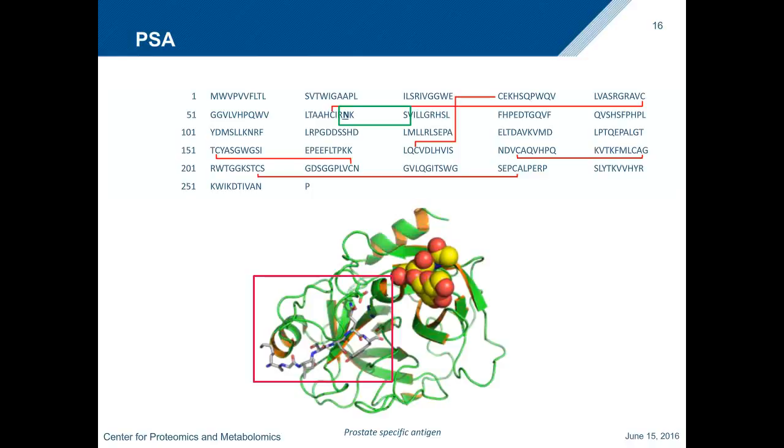So what we did, we reduced and alkylated our sample and performed a tryptic digest. If you do a tryptic digest, you will cleave off the arginine and lysine, and that means we will have a really small peptide backbone if we have a complete cleavage. So we only have a peptide backbone of NK.